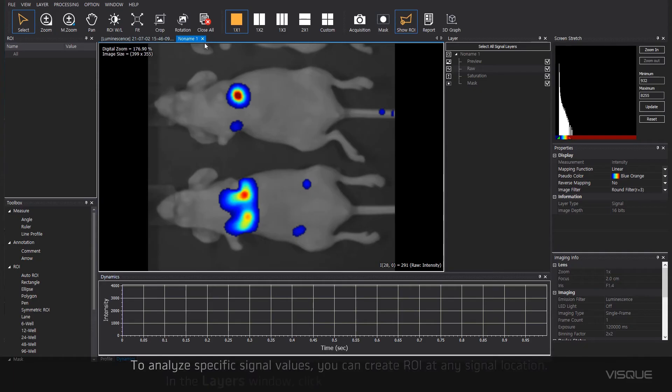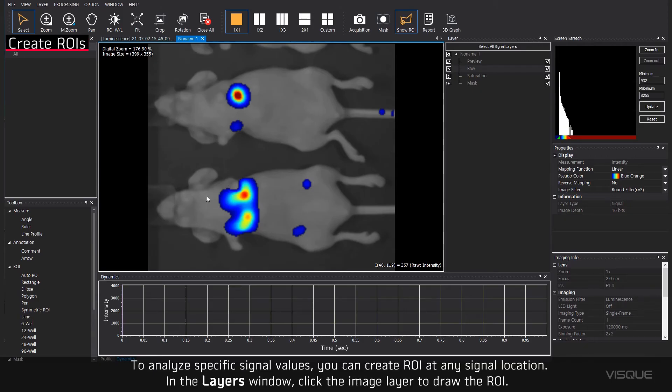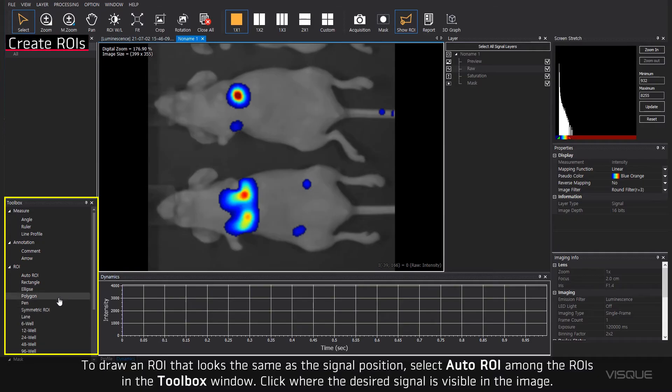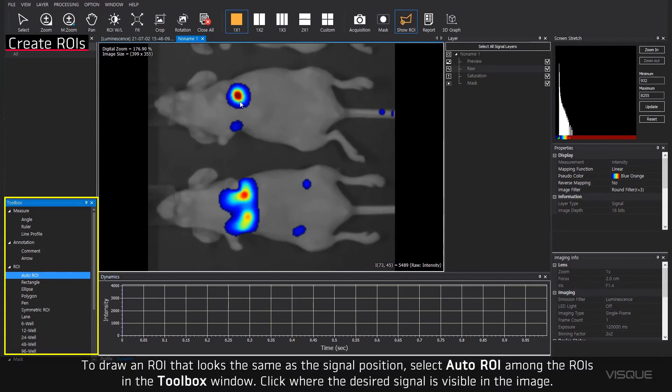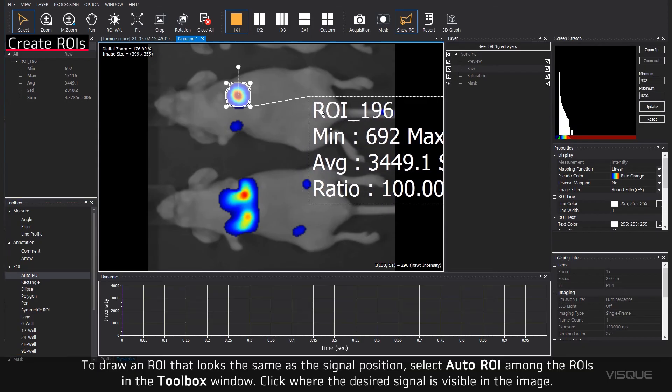To analyze specific signal values, you can create ROI at any signal location. In the Layers window, click the Image layer to draw the ROI. To draw an ROI that looks the same as the signal position, select Auto ROI among the ROIs in the Toolbox window. Click where the desired signal is visible in the image.